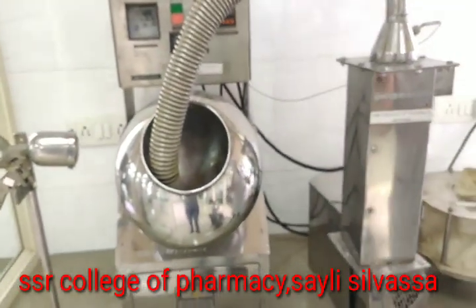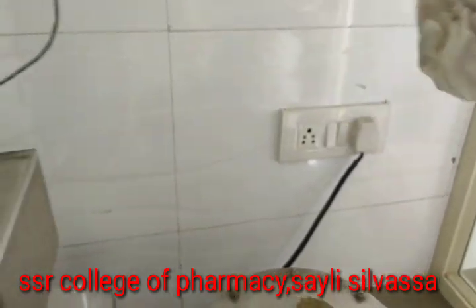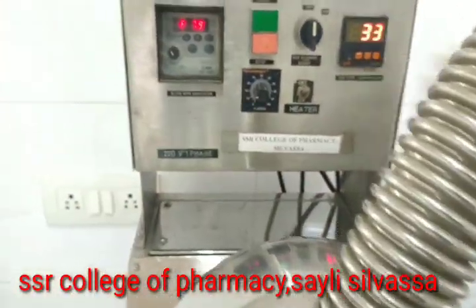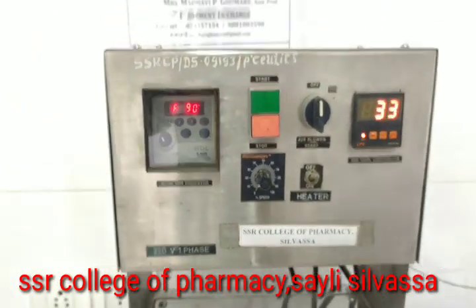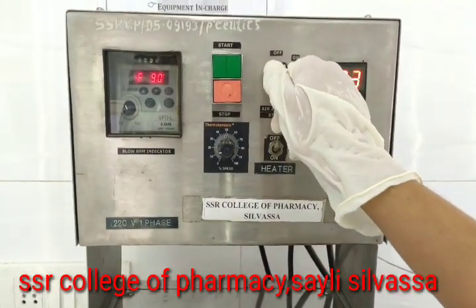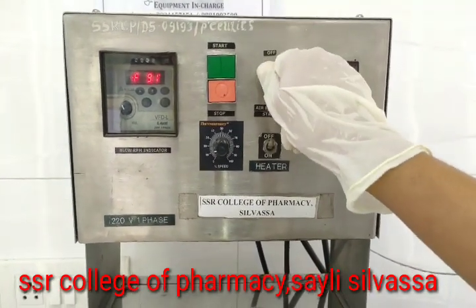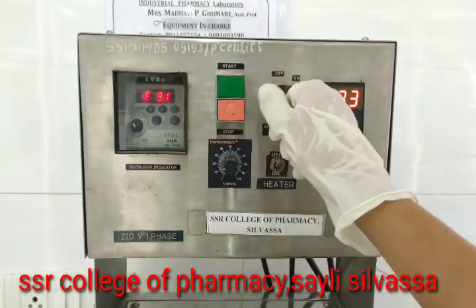For starting this equipment, we switch on the main button and then we get this display. Here is the air temperature controller — we can set the temperature we want and then switch it on.